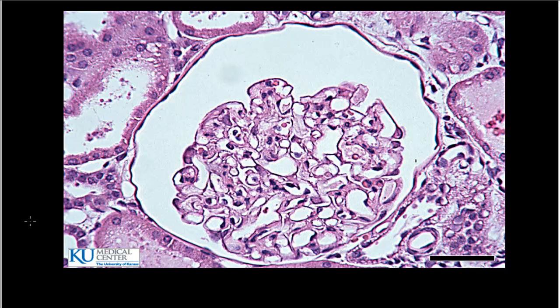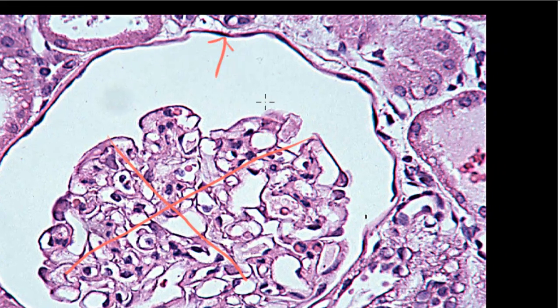So, I'm going to get rid of our drawing and bring up the first picture. This is from a great web resource. This is from the Kansas University's HistoWeb. So, you can go online and look at JDoc HistoWeb. And this is a picture of a renal corpuscle. That's part of your kidney. And we're not going to concern ourselves with the stuff in the middle. What we're worried about is this part right up here.